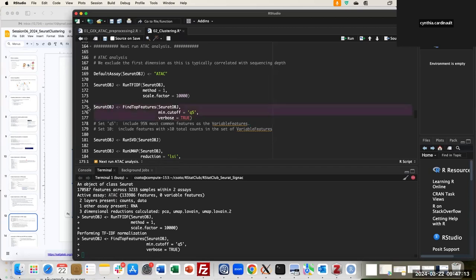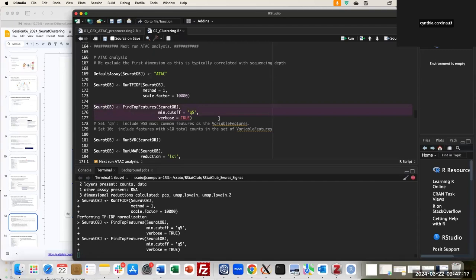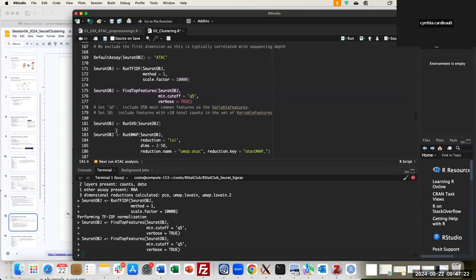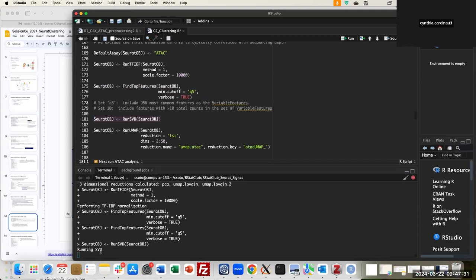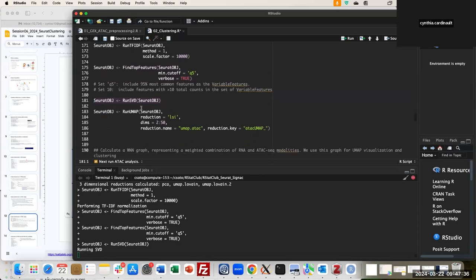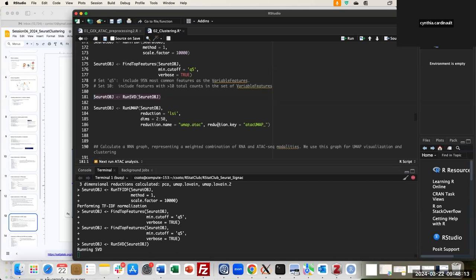I run TF-IDF and then finish the LSI normalization by running the singular value decomposition. This takes a bit more time. In the next line, after completing the dimensionality reduction for the ATAC side, I run UMAP and specify I want to skip the first dimension — which is usually related to sequencing depth. This is the reduction name I'll use. The reduction key is a metadata column that will be attached to the object.